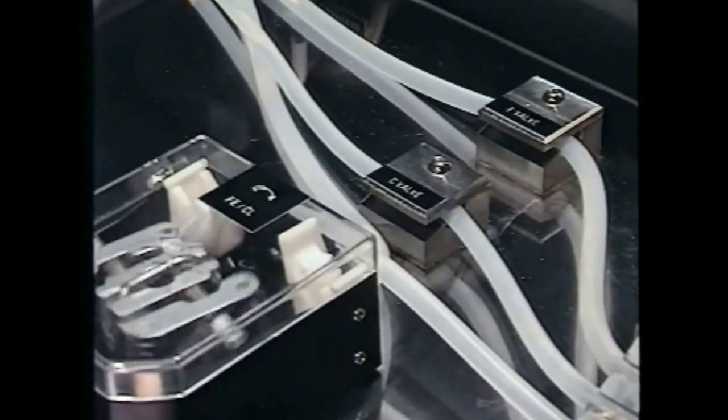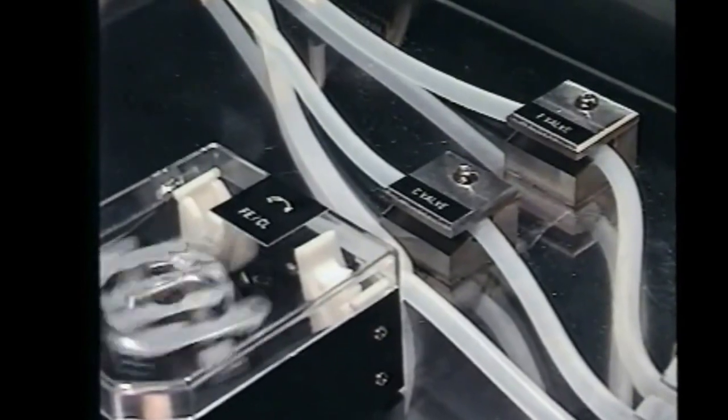These valves operate by squeezing the tube, again ensuring that the system is totally contained.